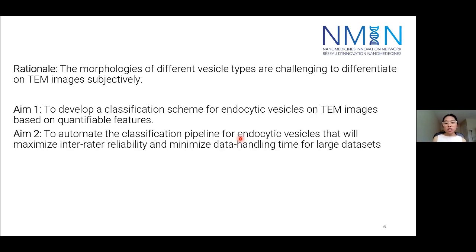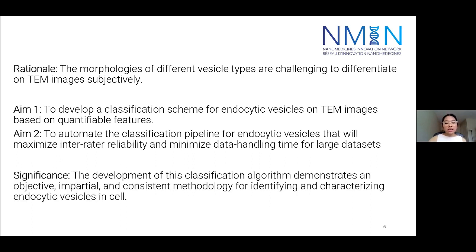And to take the project a step further, we would then like to automate this algorithm such that it would enable consistency in assumptions and, in hope, reduce data handling time when analyzing larger data sets. We care about characterizing and classifying these endocytic vesicles into different vesicle types because then it will enable us to apply the same methodology to nanoparticle-containing vesicles inside of cells. The development of this classification algorithm demonstrates an objective, impartial, and consistent methodology for identifying and characterizing endocytic vesicles in cells.